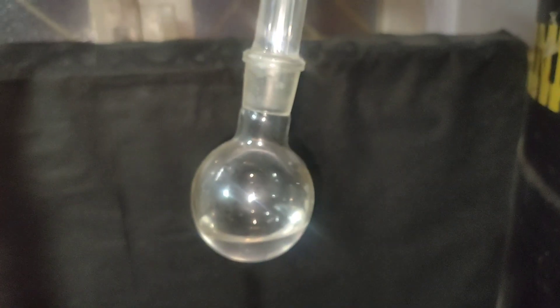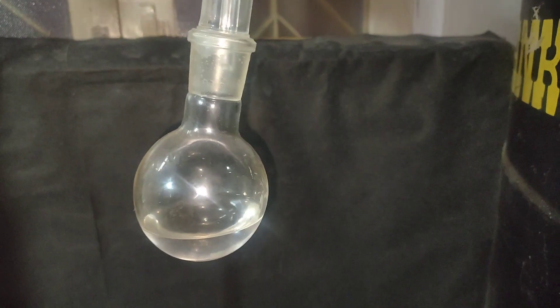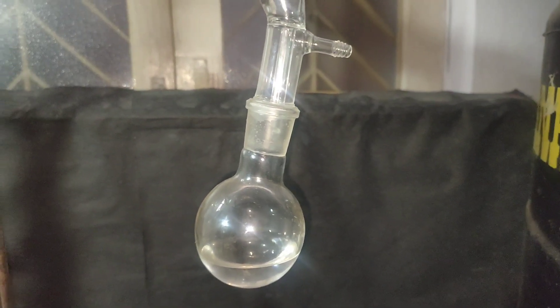I collected all the distillate that came around 50 to 65 degree celsius. This could be the chain isomers of hexane.